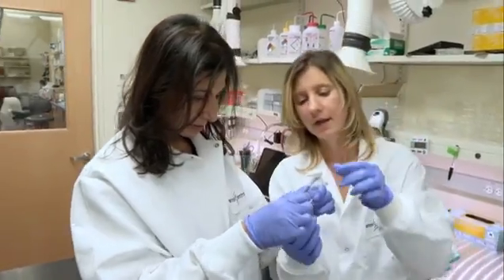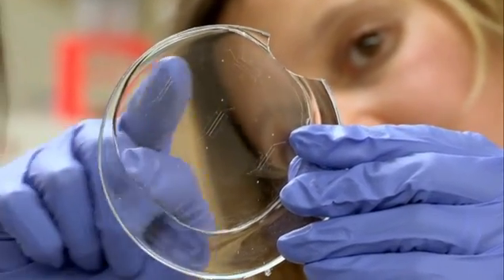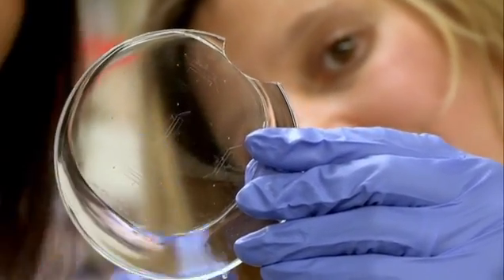So now you have your channels and each one of these is a chip. Oh, so there's four chips in this.